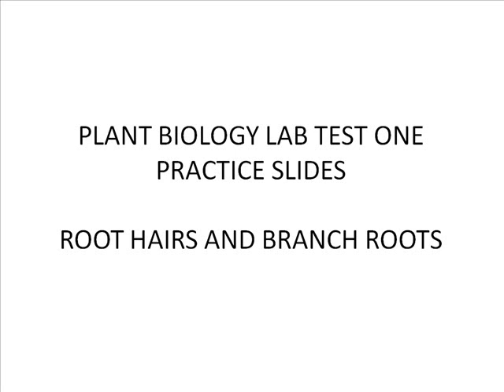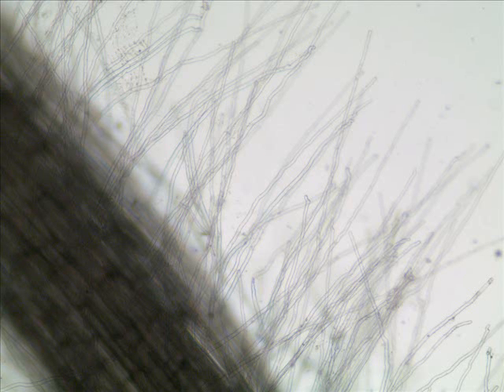So here we go. I'll ask some questions. I'll pause. You answer. See if you can beat me to an answer. Of course, these are what? Wow, root hairs. Root hairs, and we see lots and lots of root hairs. And we decided a root hair is one cell or a bunch of cells, each root hair. Just one cell, just one cell.